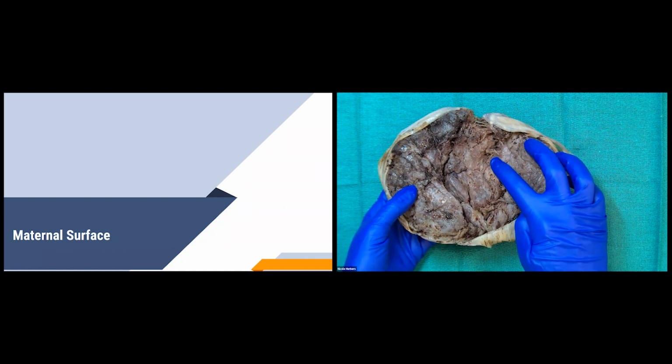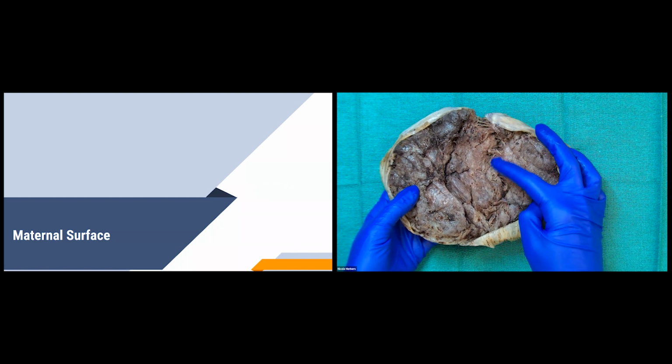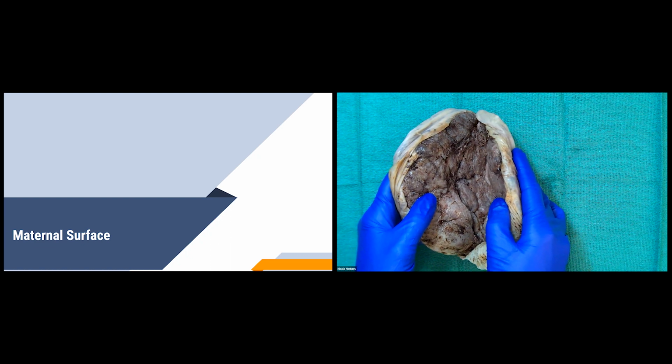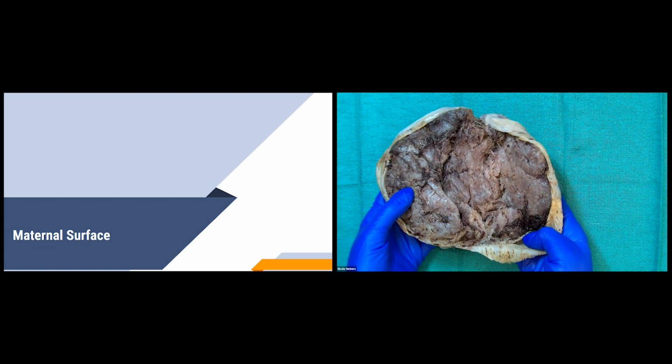These areas where it looks a little bit irregular here is just from artifact from formalin fixation, where the placenta was kind of curled like this, and I had to open it just to demonstrate that maternal surface.